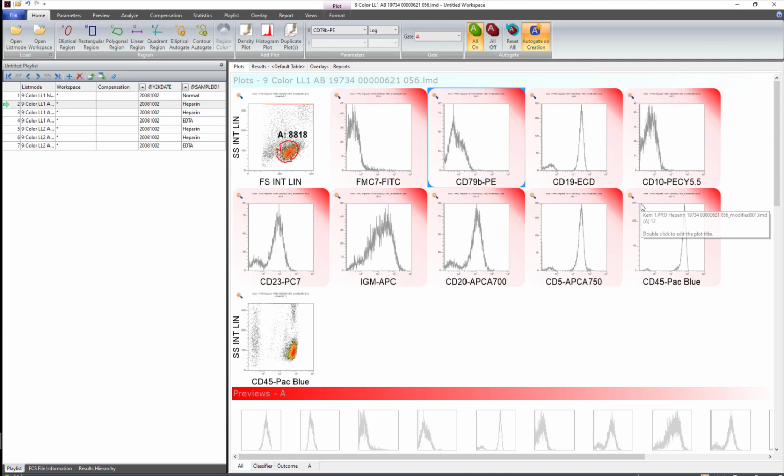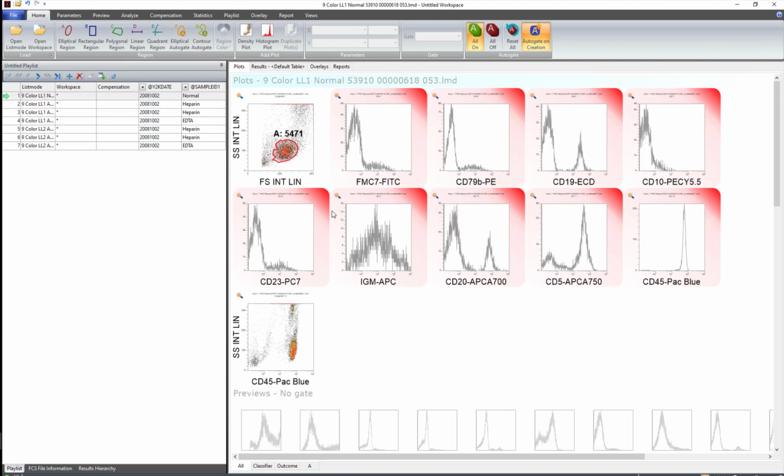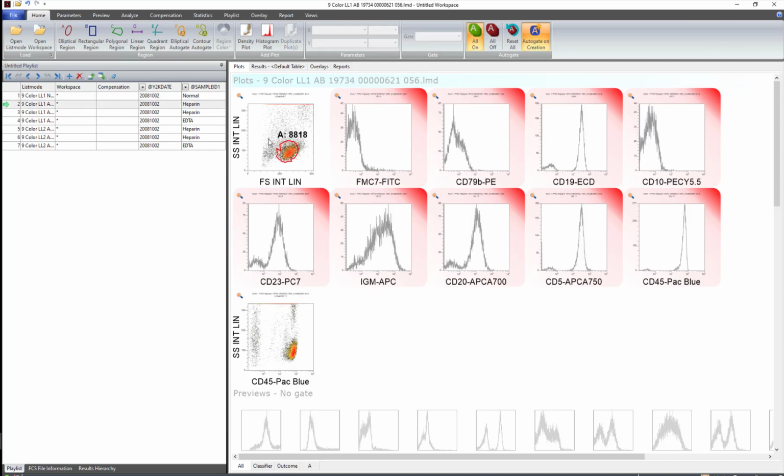If I want to create an overlay of dual parameter plots, I can do this in the same way. Right click on the plot, then Send to Overlay Plots, and in this case I can only send to a new plot because the first two overlays were only single parameter overlay plots. Then I can go to the second sample and send that to overlay 3.